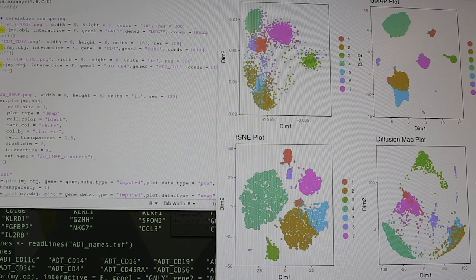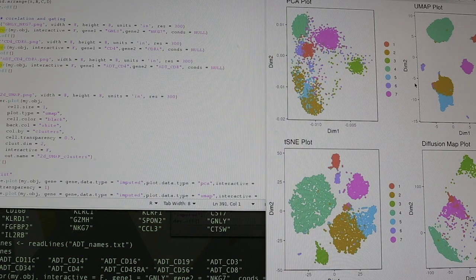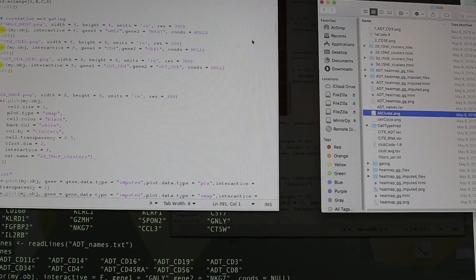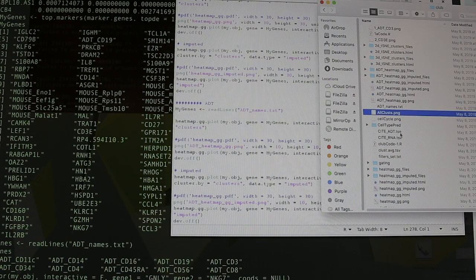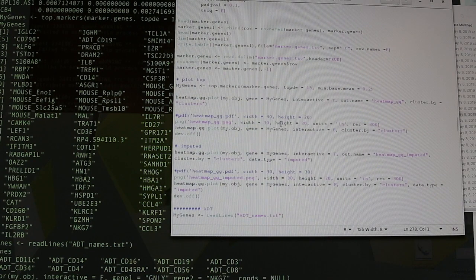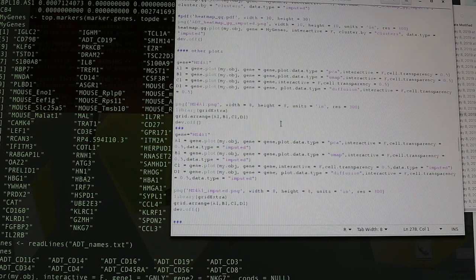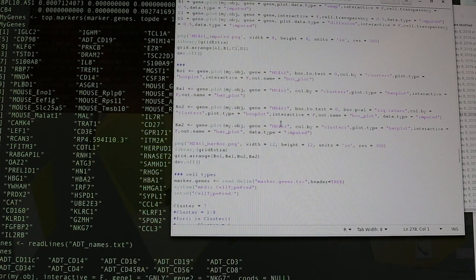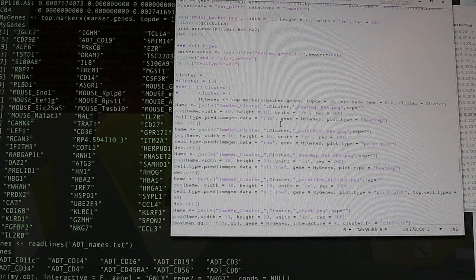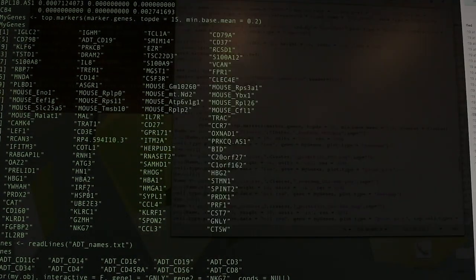And one of the other unique things that iCellR offers is that it does cell prediction. Why this doesn't close, I have no idea. Okay. So you could, for example, here, if I say, okay, that's what we want, types. So here, let's say you want to choose. Let's say you did this.